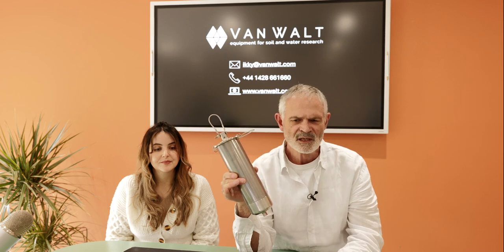At the top you have 2 harnesses, an outer one and you have an inner one. And if I pull on the inner one, you will see that there is a plunger there which is lifted. At that moment in time, the base of the sampler is open, so the water will go into the sampler. Usually we say allow up to 10 seconds to do that. And once you've done that, you release, and now the sampler is actually locked in position with a sample inside here. It's about just over half a litre, 600 millilitres, I think.